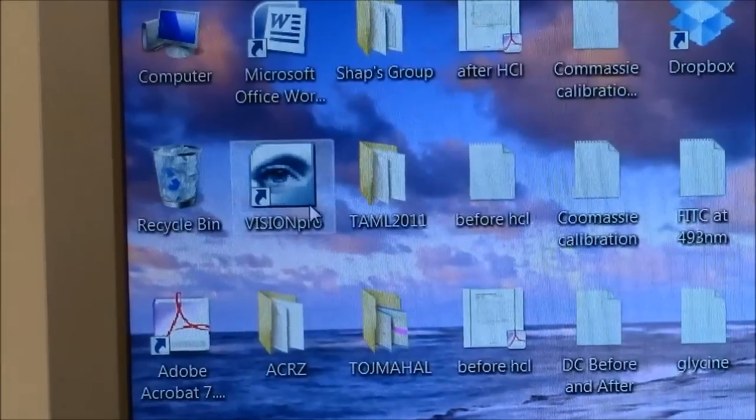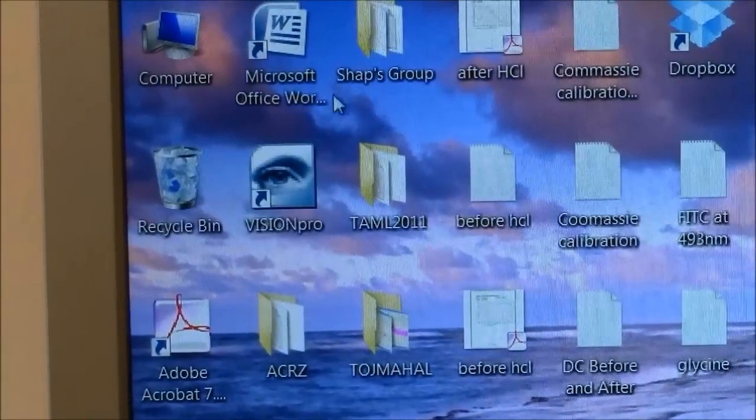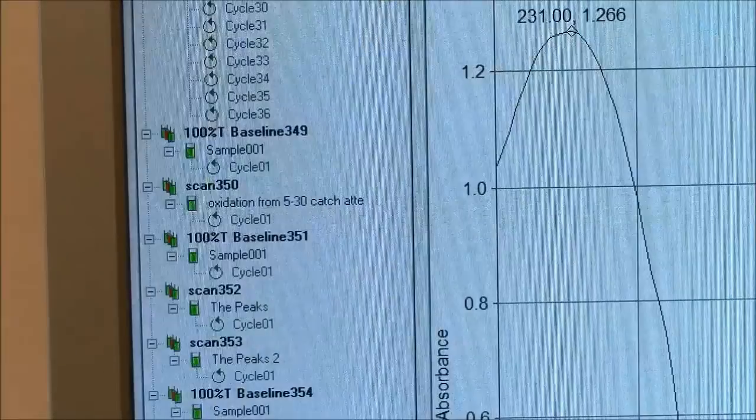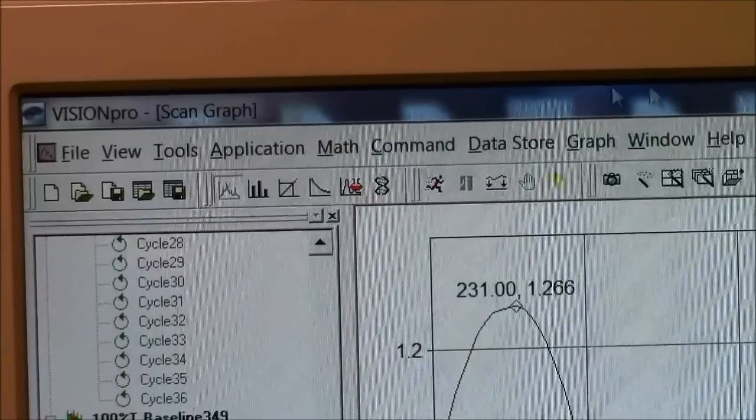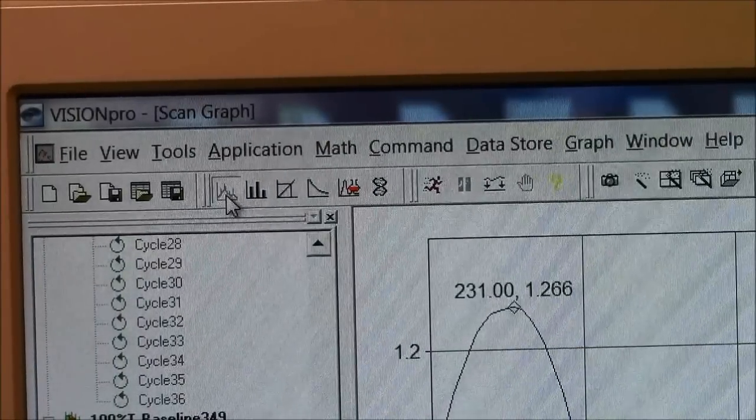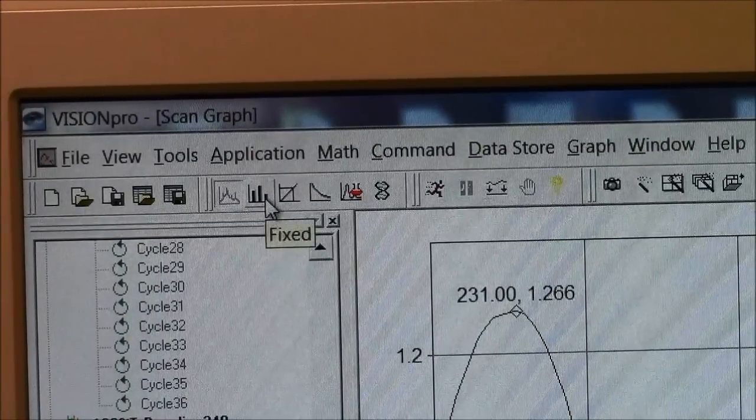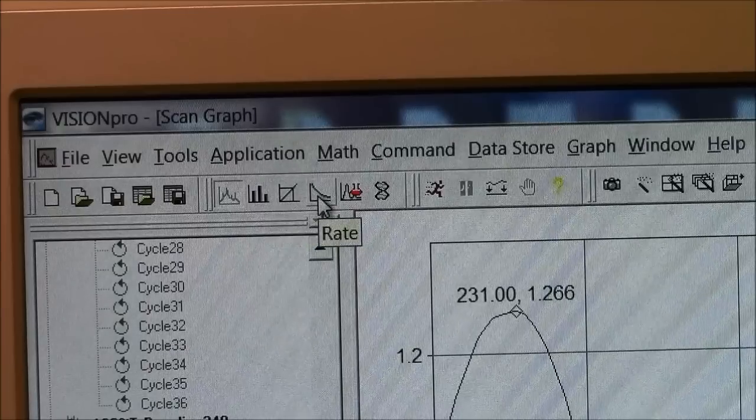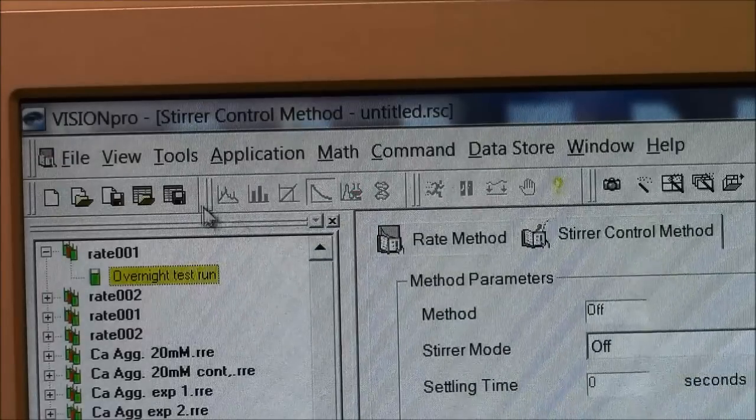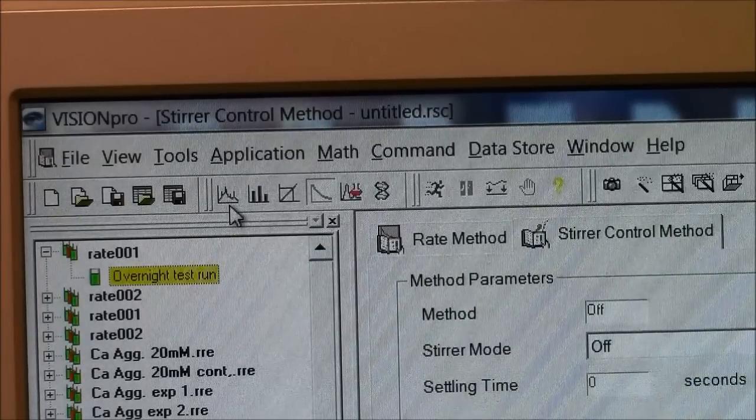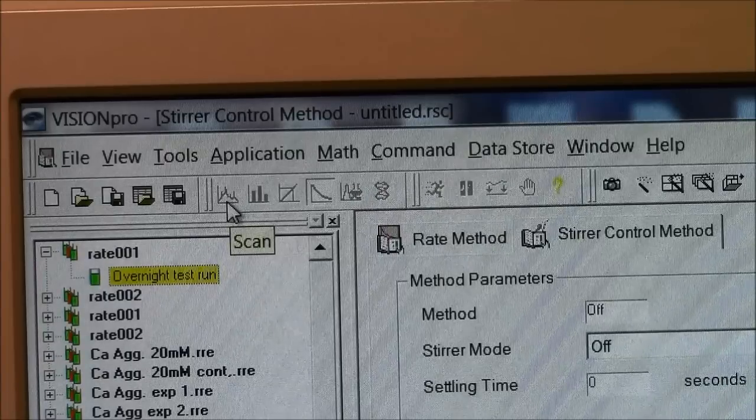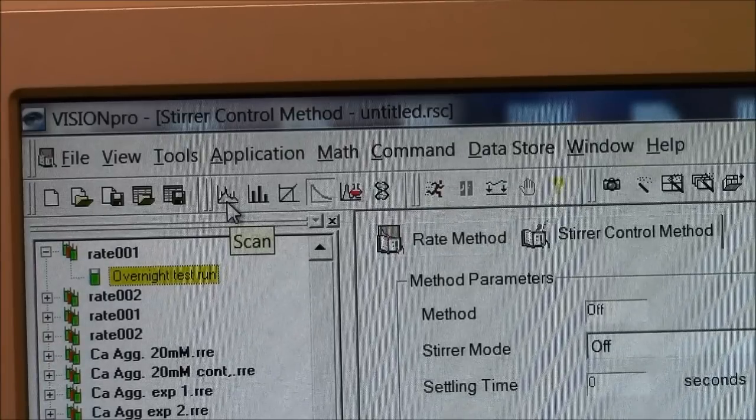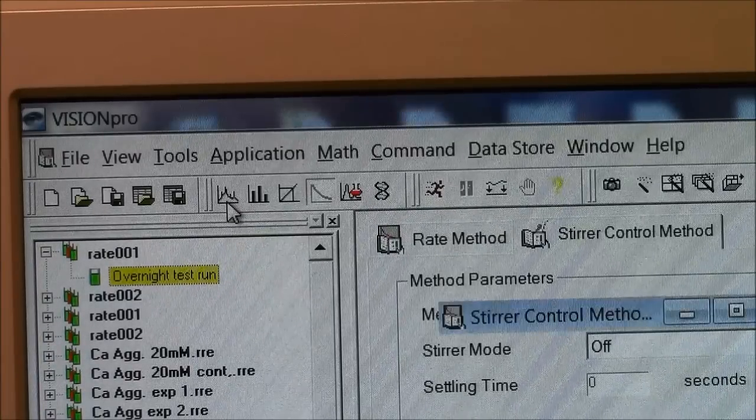The program you use on the computer is called Vision Pro. For a wavelength scan, you need to choose this icon here. This says fixed, this says quant, this says rate. This one here that looks like a bunch of mountains is scan. Choose that.